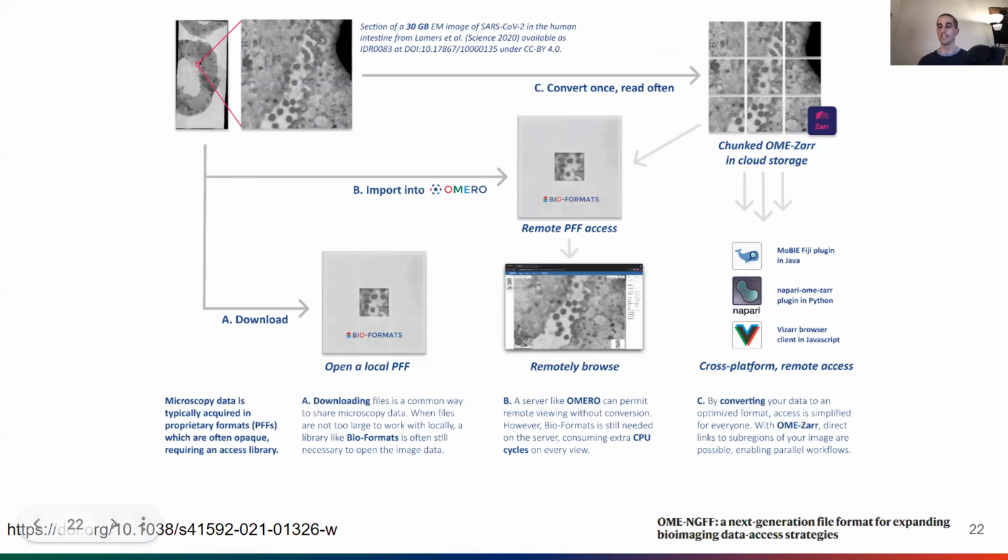So this is from the poster from OME this year, trying to get everything in one slide so we don't have to click a bunch. Like I said, we're all used to the problems of file formats in our domain. Obviously, that's where Bio-Formats comes in, so you may have used it without even knowing. Very briefly, Bio-Formats is a library to help all of us get our data out of the proprietary file formats that we're dealing with.